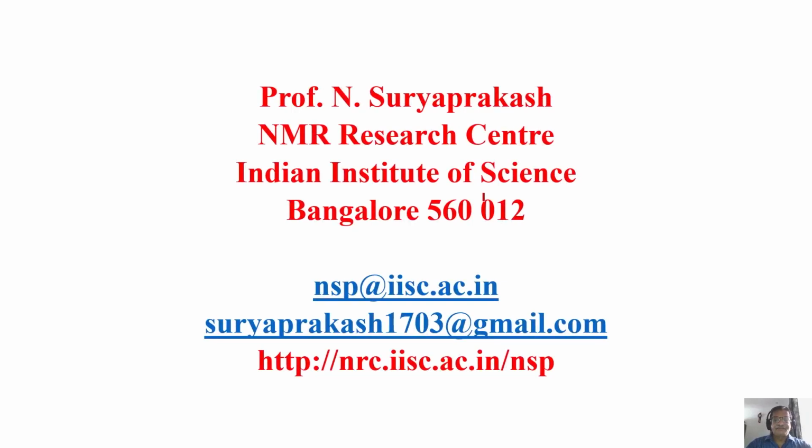Welcome back. In the last few classes, we discussed two-dimensional NMR extensively. Especially, we also attempted to interpret COSY, TOCSY, coupled and decoupled HSQC, HMBC spectra, and also we looked at homonuclear J-resolved spectra.